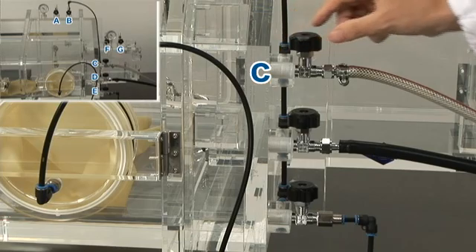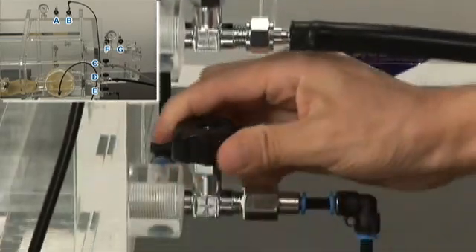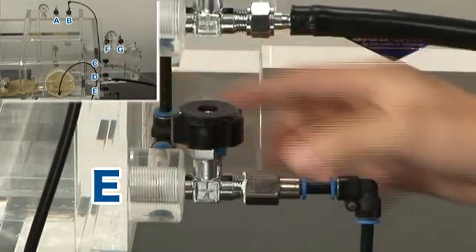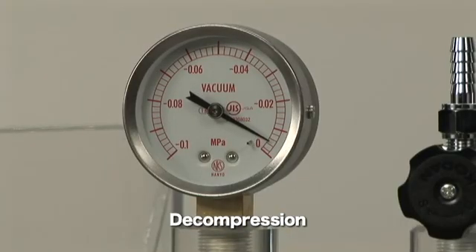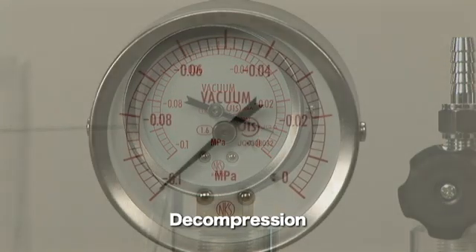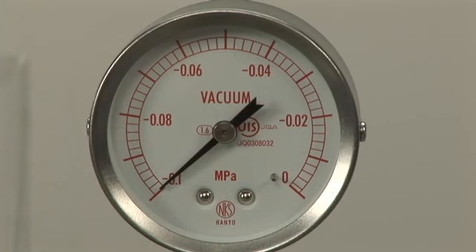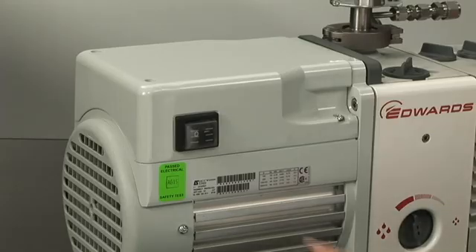Then, open a certain valve and operate it to reduce the pressure. When the vacuum gauge indicates, close the valve and stop the vacuum pump's operation.